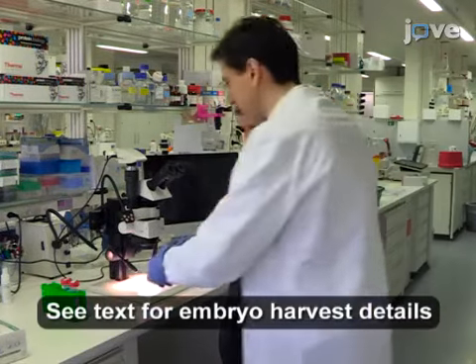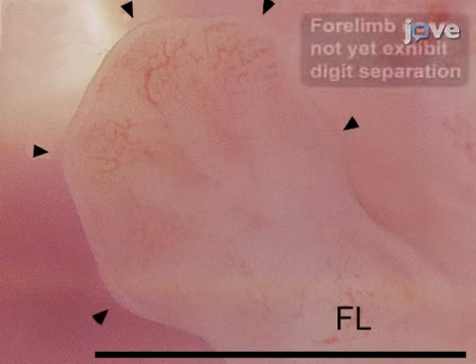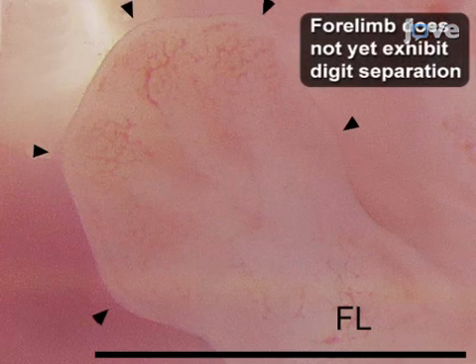On embryonic day 14.5, confirm the correct age of the rat embryos by the presence of beginning digit formation in a rat forelimb.